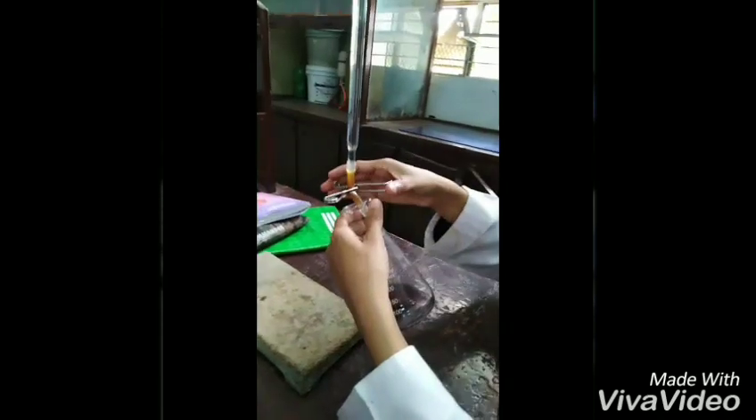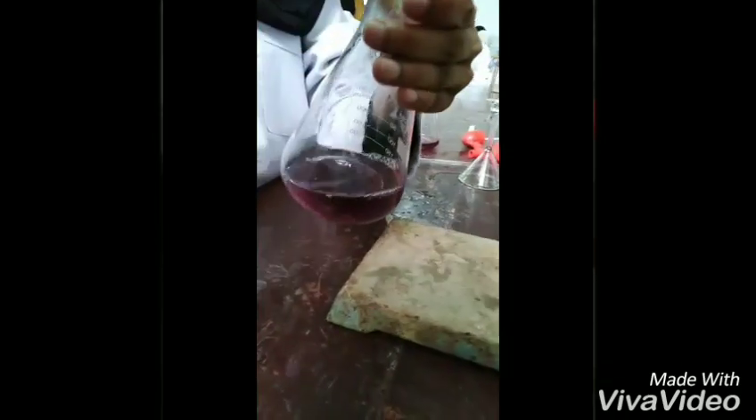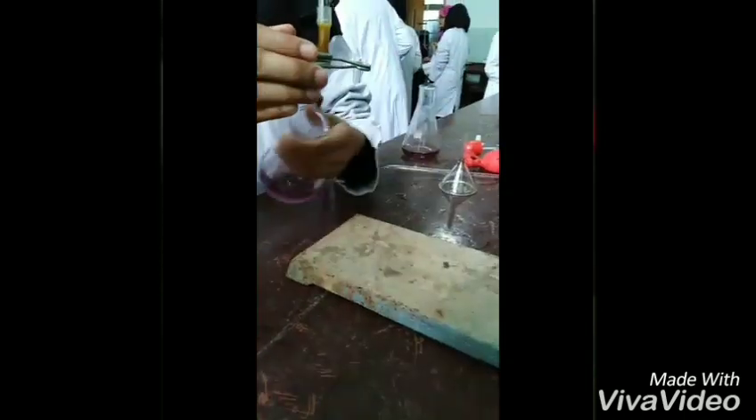Eriochrome Black T indicator will form a complex with the metal, that is magnesium, and the color of this complex will be red. As we titrate the solution against EDTA, the EDTA will replace the EBT indicator, and the color of the free indicator will be blue. So the endpoint will be a change from red to blue.